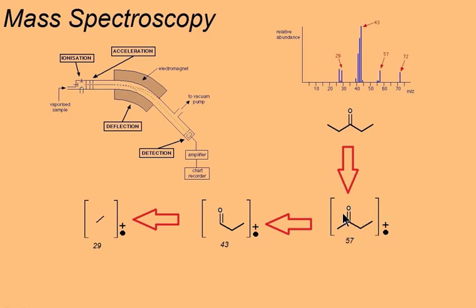So collectively, both things can happen. Sometimes the molecule breaks up to give a cation, sometimes breaks up to give a radical. So we talk collectively about these cation radicals which are being produced. It's only the cations which are being detected by the machine, and the vacuum sucks out any radicals which would endanger the machine being filled up with unwanted sample.